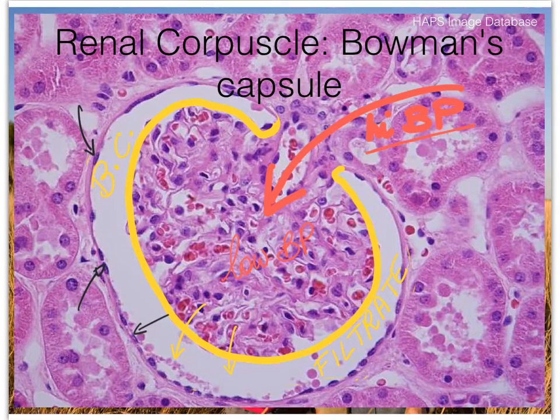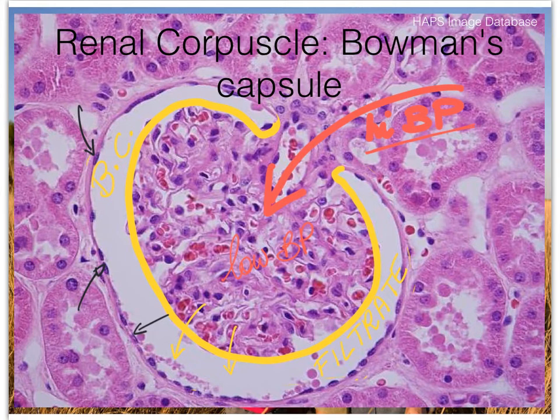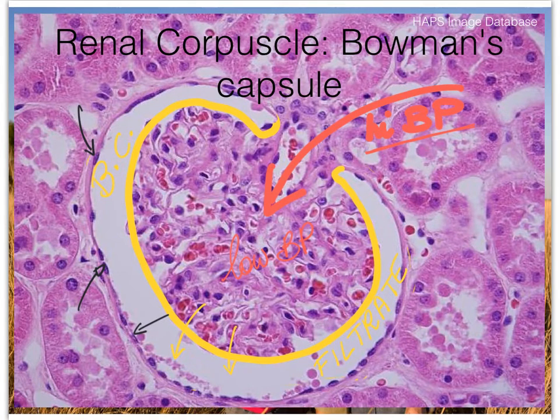So the specific location of simple squamous epithelial tissue is in the wall of our Bowman's capsule. On this slide we also see additional epithelial tissue — those are tubules in the kidneys that squiggle all over the place. They have a lumen and that lumen is lined with simple cuboidal epithelial tissue. So within the same organ — the kidney — we see simple squamous epithelial tissue as well as simple cuboidal.